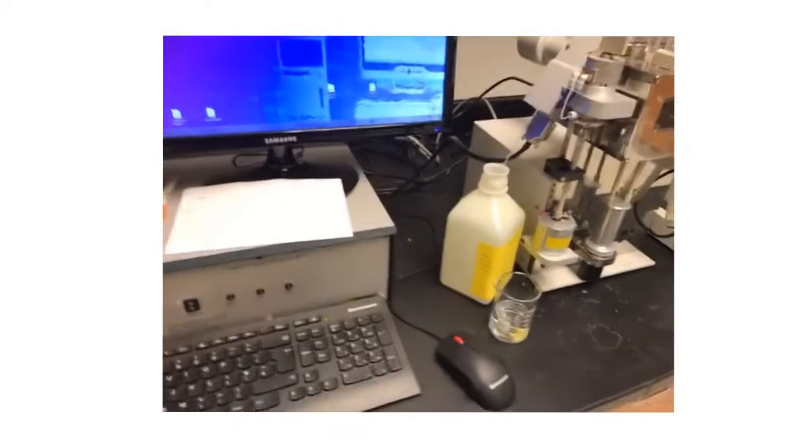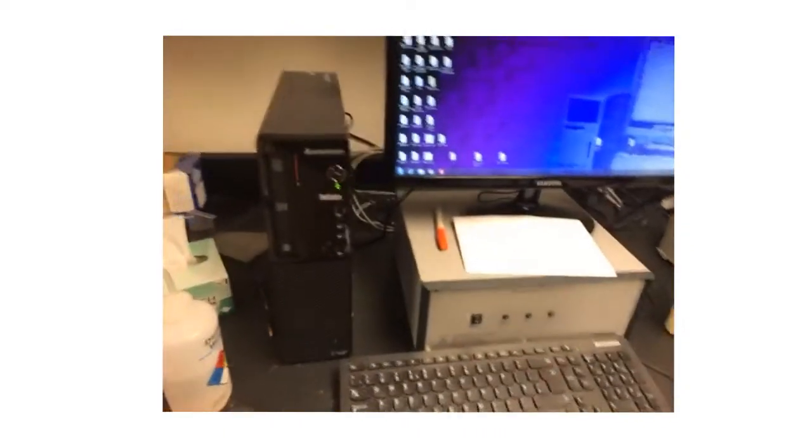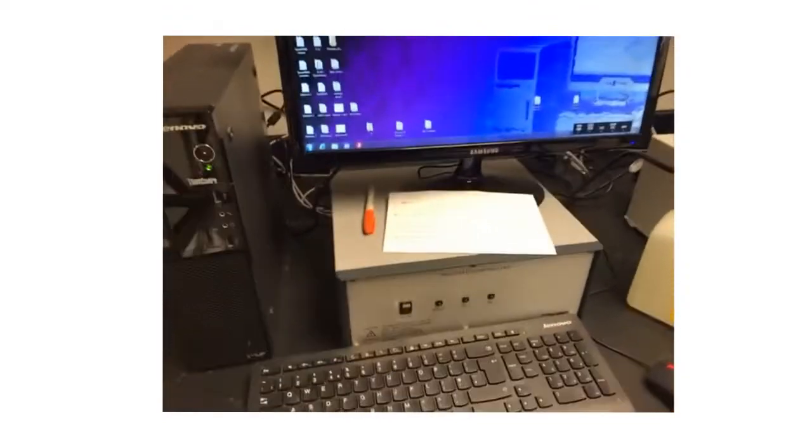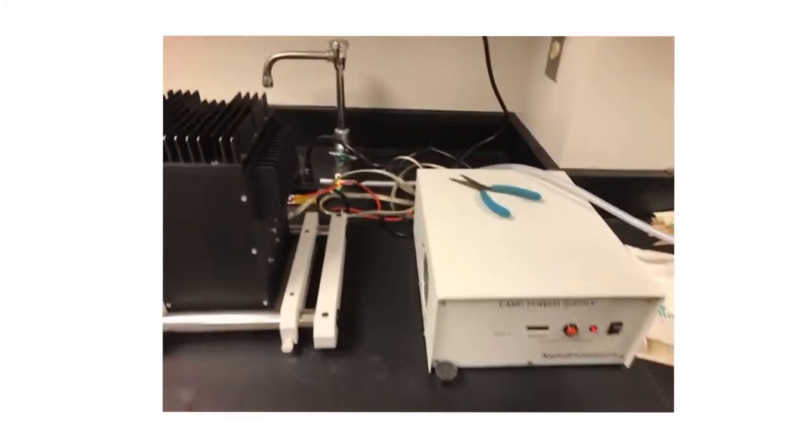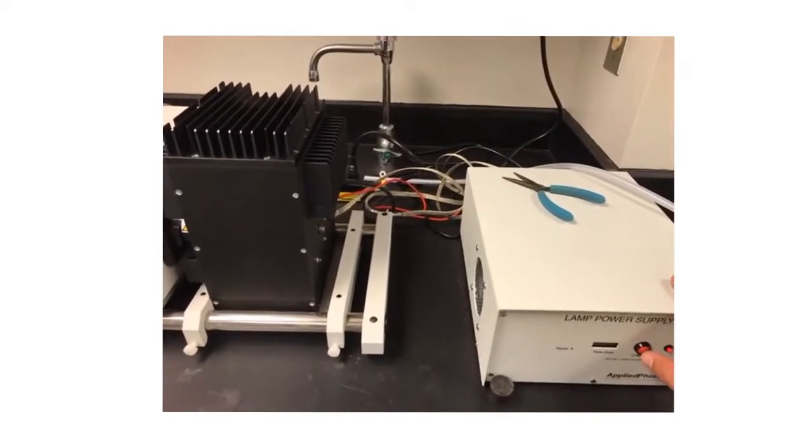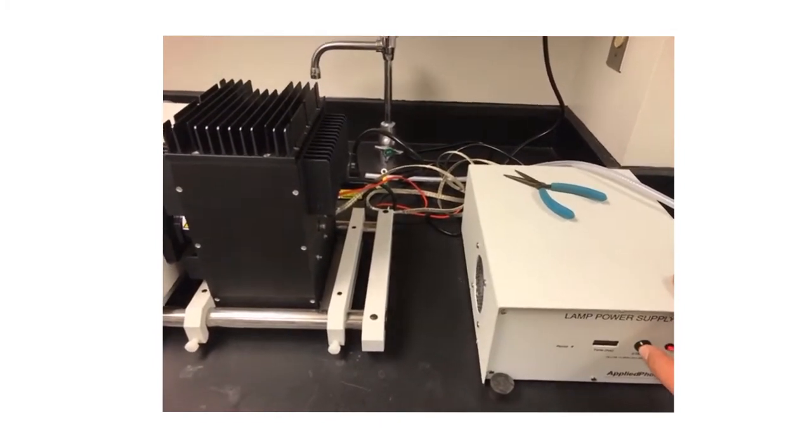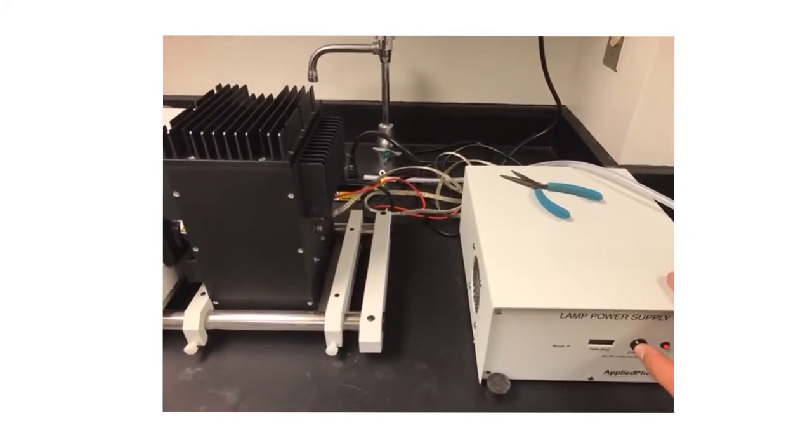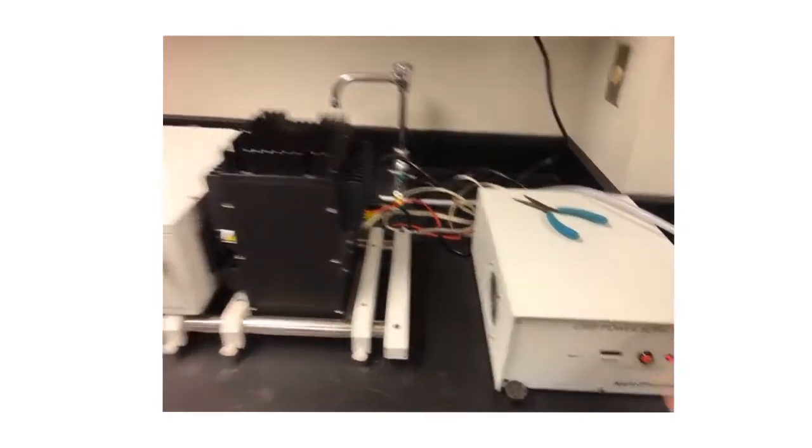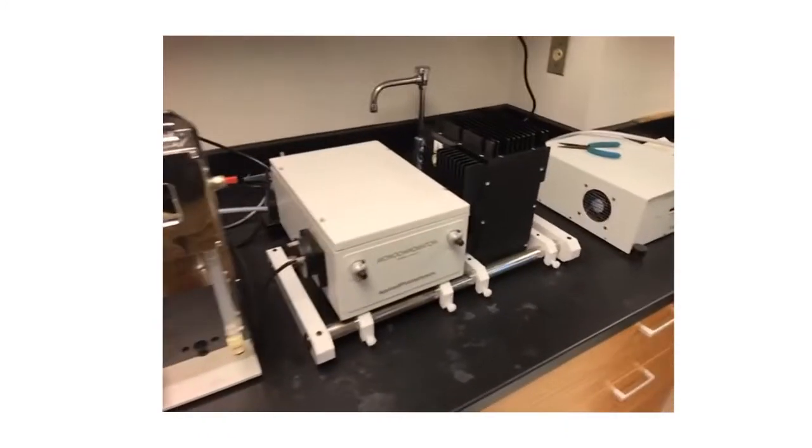The monitor turns on right underneath. And to get everything going, we just simply turn on our electronics unit. And then we turn on our power supply. We actually have to hit a start button on the power supply. We'll hold it in for about 10 seconds. You might hear a little click a few seconds in. Sometimes it's hard to hear the second click. But that second click is the powering of the power supply.